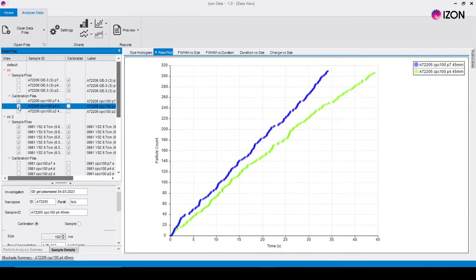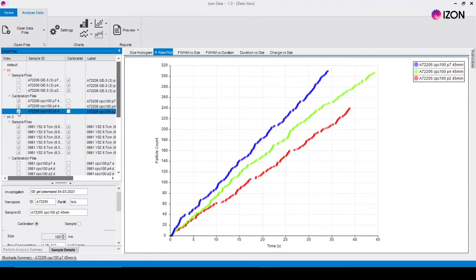If the particle rates are the same at all three pressures then the concentration calculation will not be accurate and that measurement will need to be repeated.